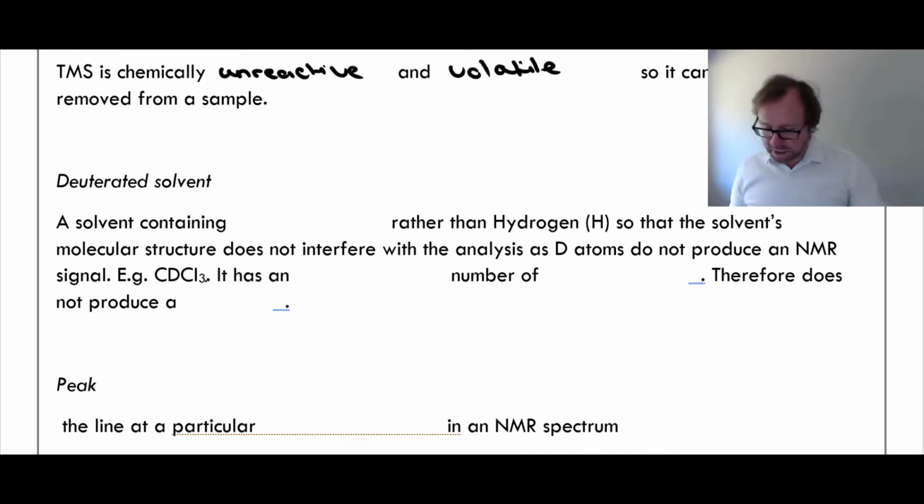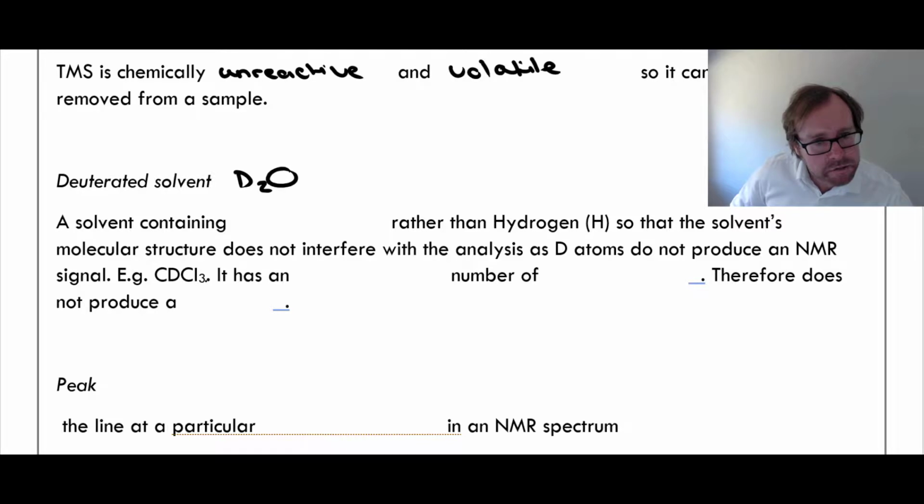So a deuterated solvent. Now we know a solvent dissolves something.